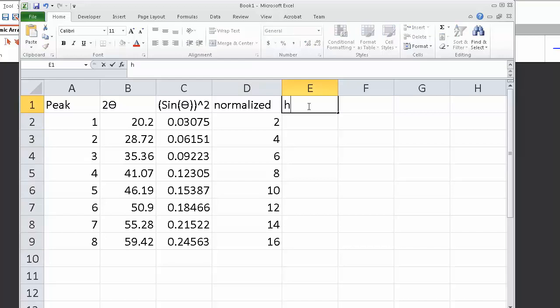So we could now index these peaks and determine of what form, that's the direction. Made a mistake. Should have used curly brackets. Okay, so {hkl} forms.